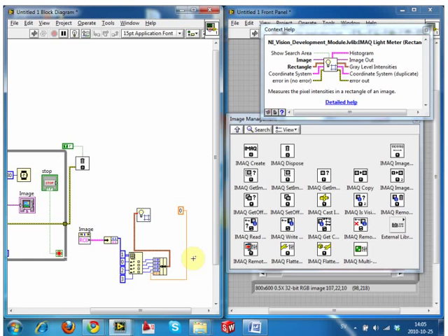Oh, okay. I know. We're about to finish. Can I just ask you a question? Yep. I'm having issues with the stage at my microscope, so I would need to try the other stage. Do you mind if I unbolt it away from? No, you can unbolt it. Yeah, that one.